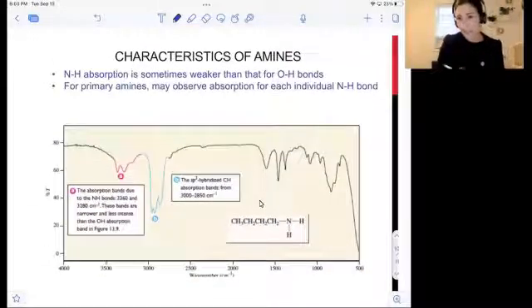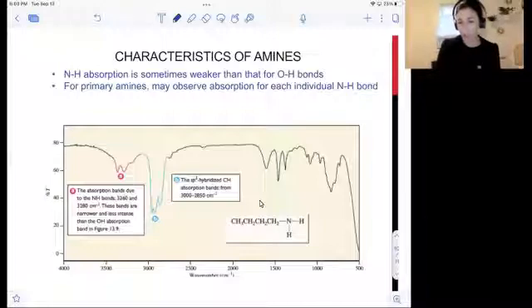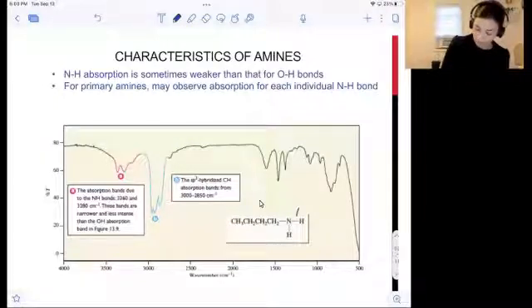The last specific data we're going to look at in this video is for an amine. Those of you who have a basic organic molecule after coming out of your solubility tests are probably going to be looking for some evidence of an amine in your IR spectrum. For the amine, much like for the alcohol, we often have a very polar NH bond shown here.